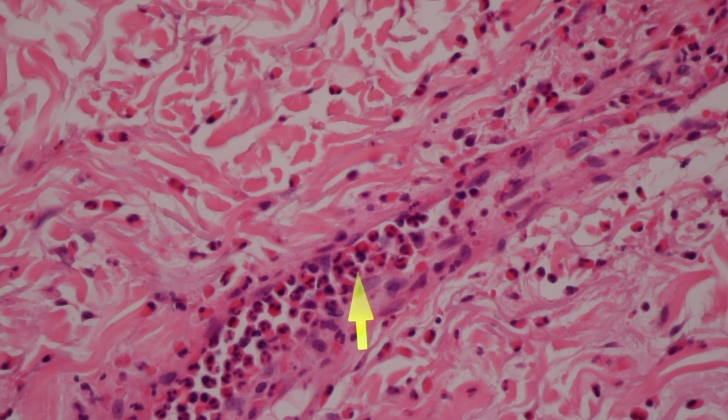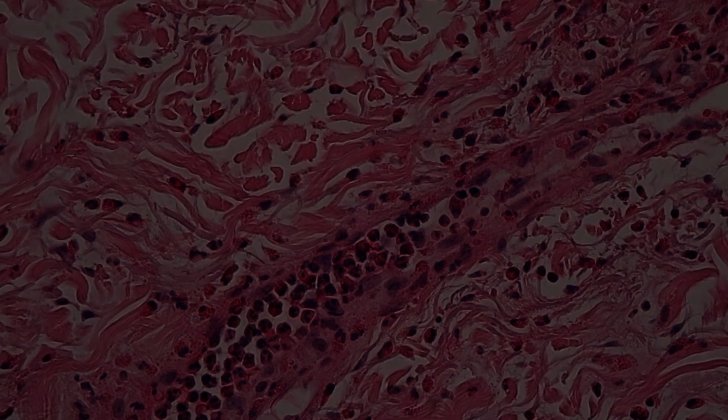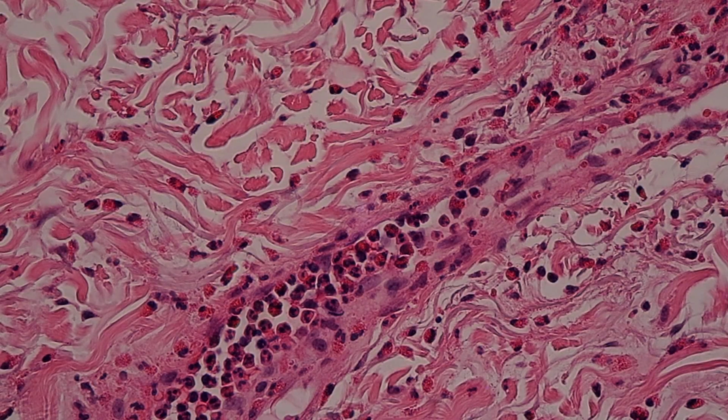So they have a more lobulated nucleus, for one thing, to be a neutrophil. Neutrophils also have orangey looking cytoplasm like eosinophils. It's not quite as bright orange, and even though neutrophils do have little granules, the granules are so small that you can't see them even on 40x. You have to use an oil immersion lens to see the granules in neutrophils. But in eosinophils, the granules show up very nicely, and on this video it's hard to see them, but when you flip the condenser, you can start to pick them up.